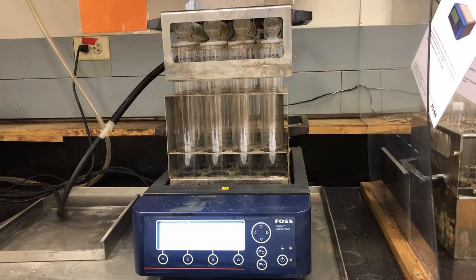So we're going to let this heat up. You can see that it's only just starting to heat up now, so we put it on when it's cool and we let it heat up gradually, and then we'll let it run. Once it gets to 420 degrees, we will let it run for probably 20-30 minutes until the sample is completely digested. And you'll be able to see when it's digested because we'll see a color change in our test tubes. So see that when we come back.